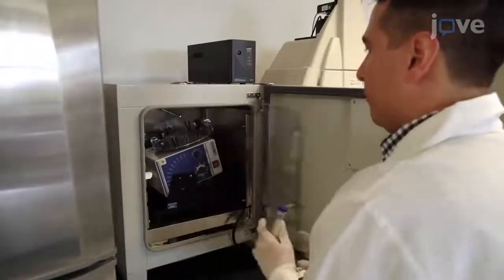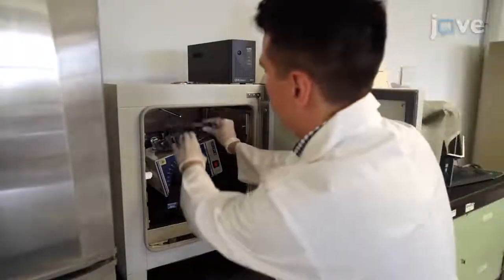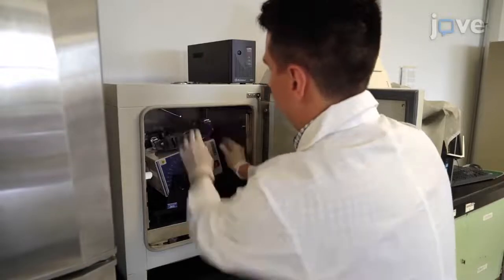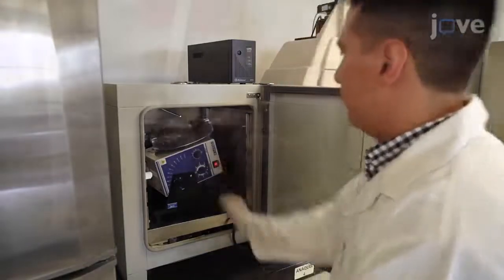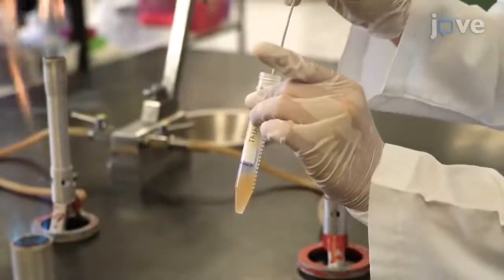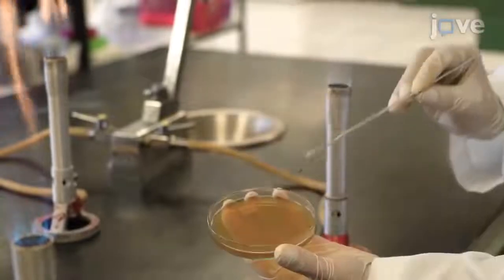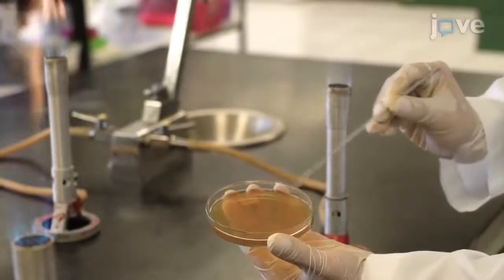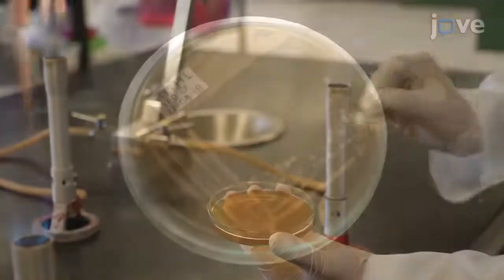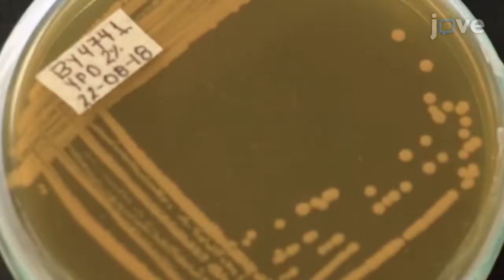Incubate the yeast overnight in an orbital shaker at 30 degrees Celsius and 200 RPM for streaking onto a 60-millimeter 2% YPD agar-filled petri dish the next morning. Culture the dish at 30 degrees Celsius until isolated colonies are observed.